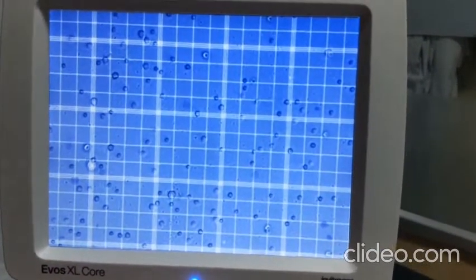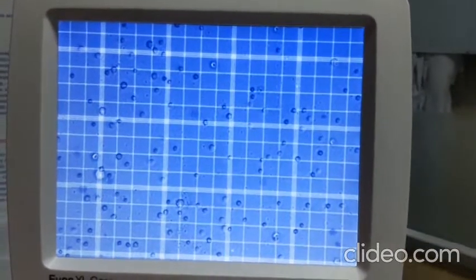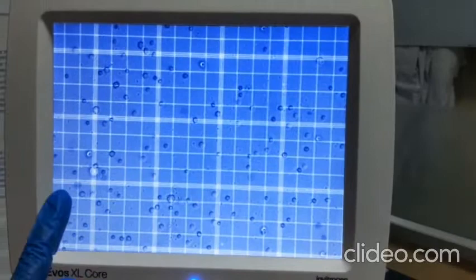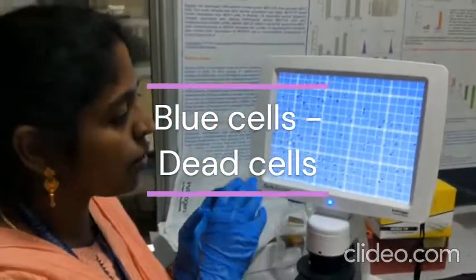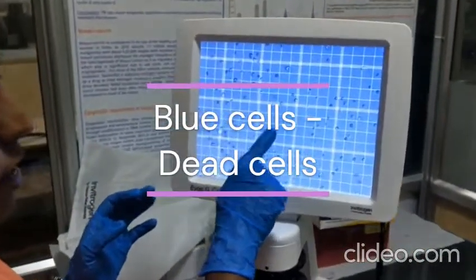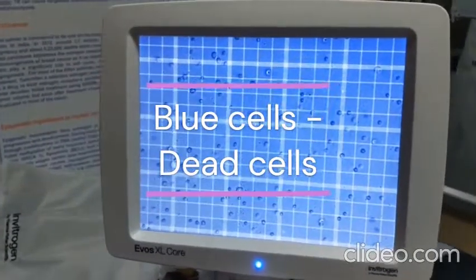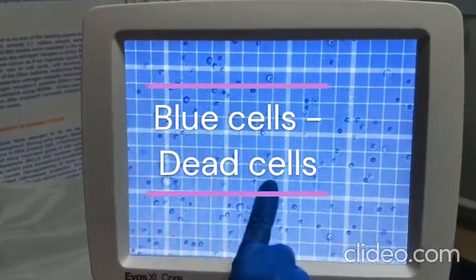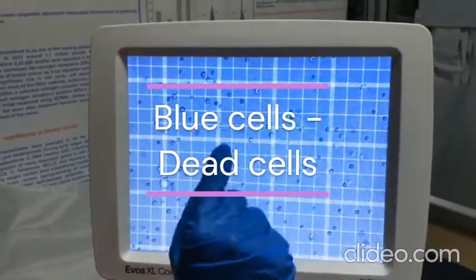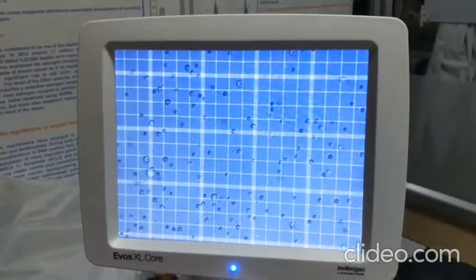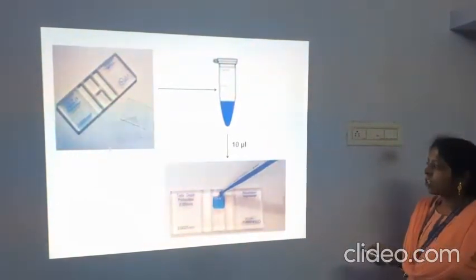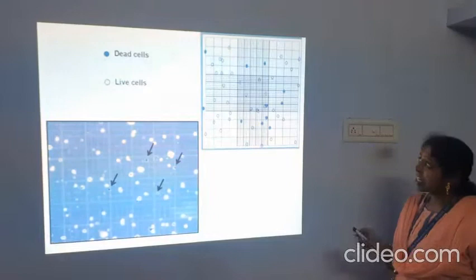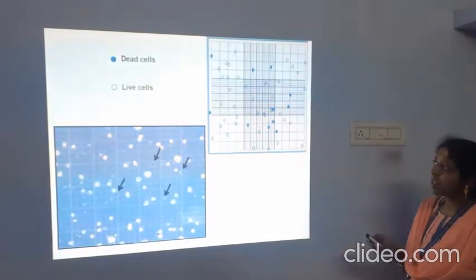After sample application, we place the hemocytometer under the microscope and focus the squares. The dark blue cells are dead cells because their cell membrane is ruptured and trypan blue enters the cell. The live cells are colorless because they have an intact cell membrane that excludes trypan blue. We count the cells present in each square.